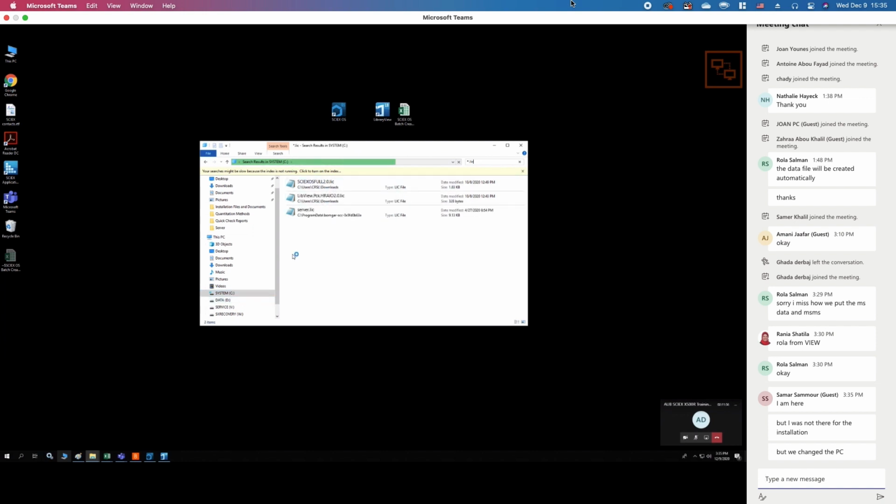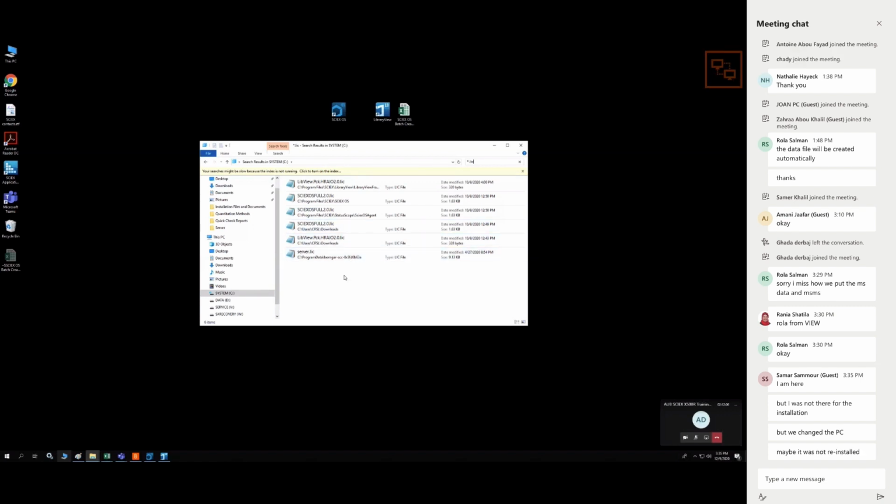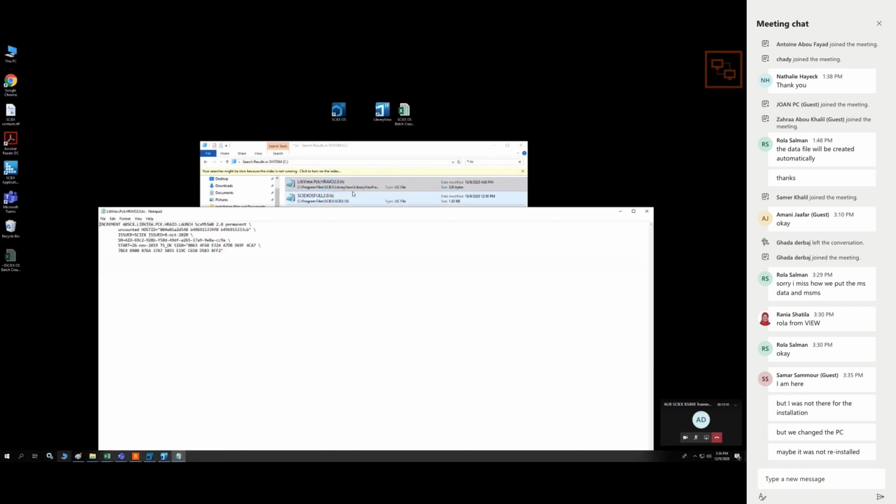Let's just take a look here. You have the all-in-one. Okay, so I will just open this. It was issued on 8th of October, and it's permanent. So it should, oh no, it was 26th of November start. But it was issued on 8th. Okay, should be okay.